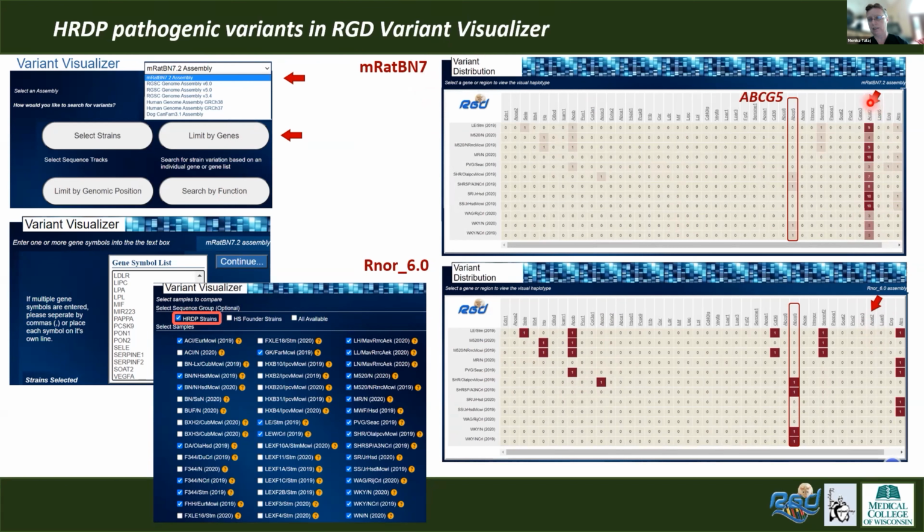I'll look at whether it's real, but if you see something like this, there are two possibilities: it's a genome problem or a model annotation problem. So I probably need to look at the BAM files to see how the reads are falling there, whether it's a nice alignment, and then at the gene model, how it was in the previous assembly, to see why I don't see those data here.